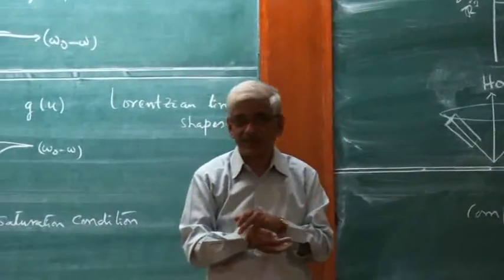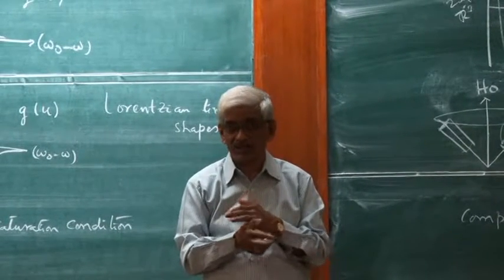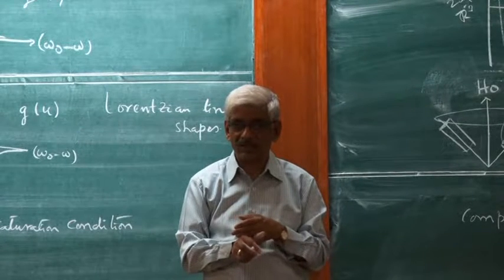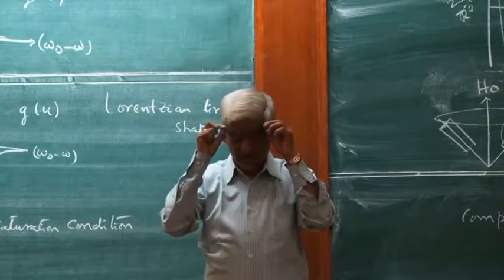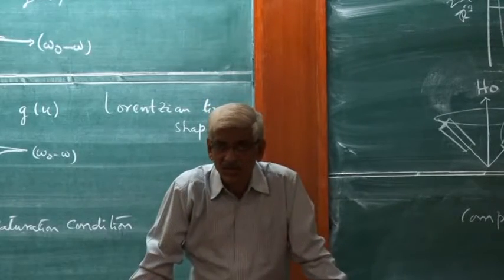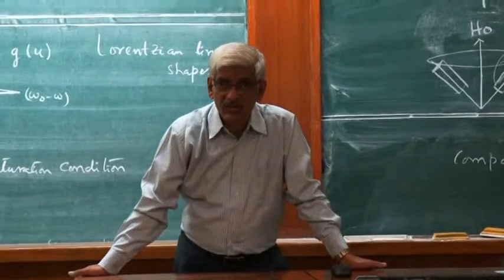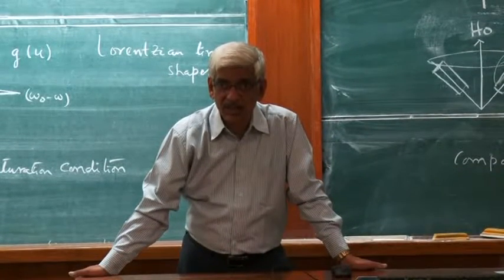In case of T1, when those frequencies were fluctuating, then some of the frequencies were matching with delta E, the transition frequency, and then the transition was taking place. And the population difference was maintained. So who is maintaining this biasness? Like more population will be in alpha and less will be in beta. Meaning, not all the spins will go to beta. Only some of them will go to beta and some of them will be in alpha. So who maintains this biasness?